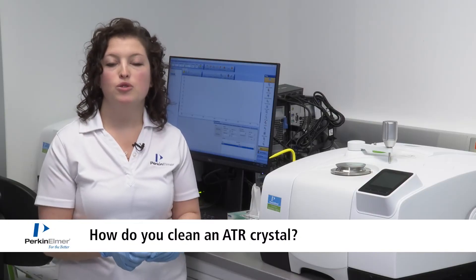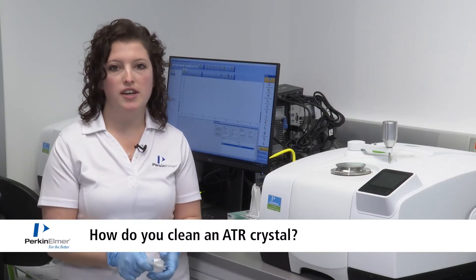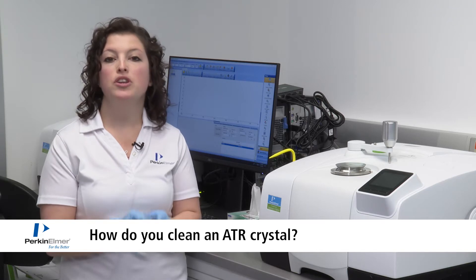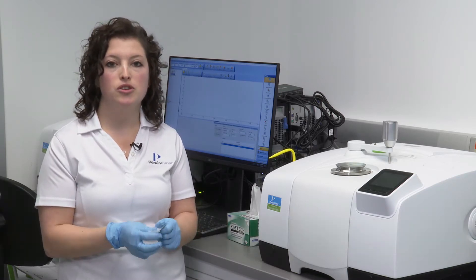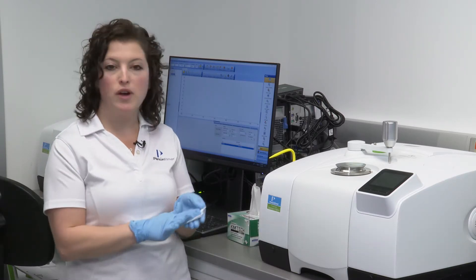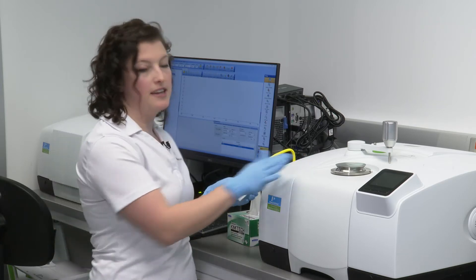Cleaning the ATR crystal is one of the most common questions we get. It's important that when you clean the ATR crystal you make sure that you squirt the solvent directly onto the chem wipe and not the ATR.